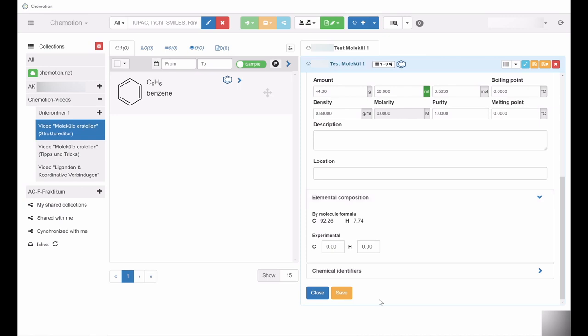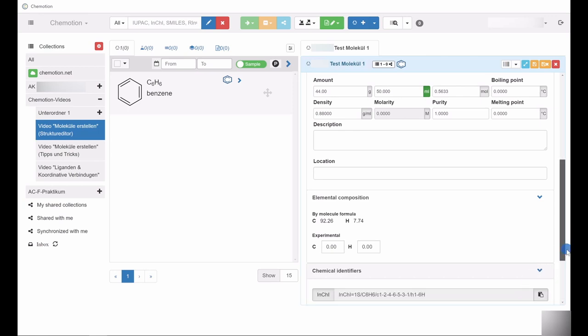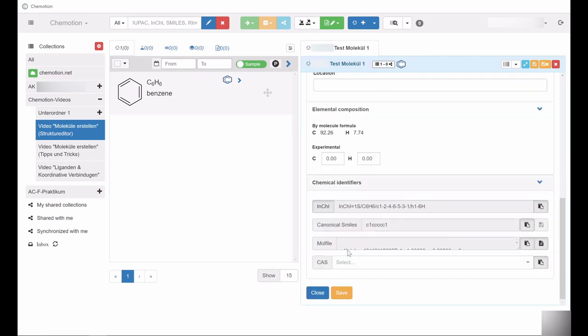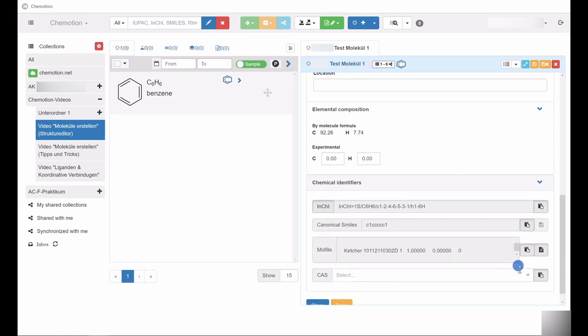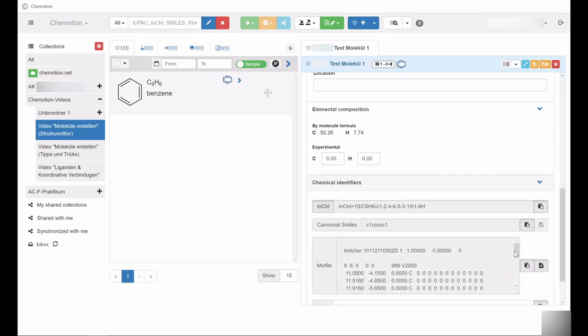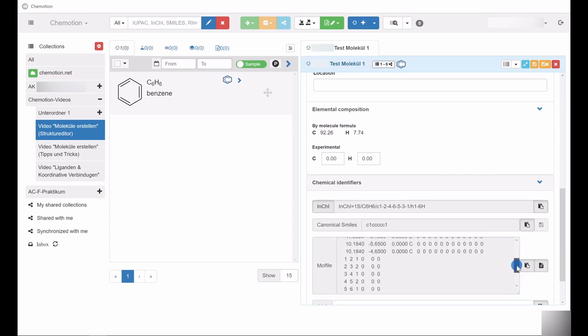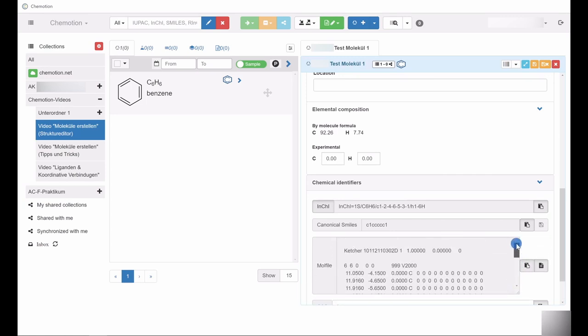Further down, under the category Chemical Identifiers, you can find the automatically generated SMILES codes and MOL files. InChI codes are provided here as well. Please note that by clicking on the InChI box, it is possible to switch between the InChI and the InChI key code.